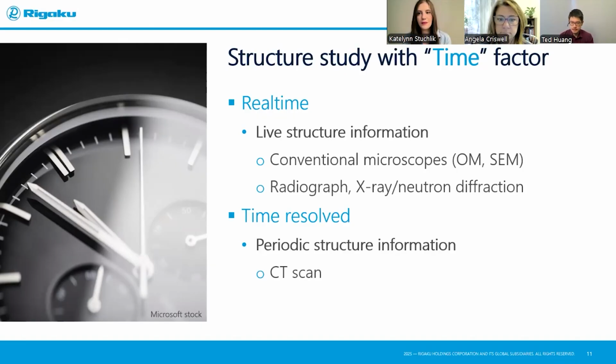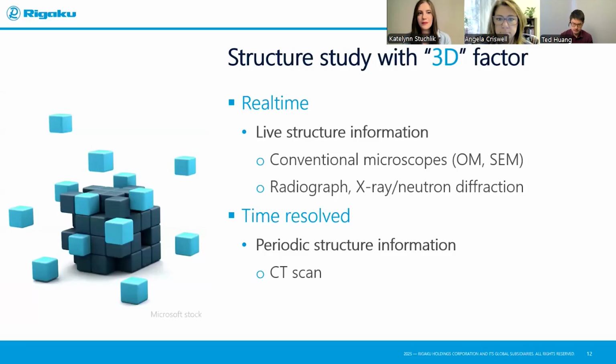Now, if you just look at this list, you might ask, hey, Ted, then doesn't that mean CT is not as good because you can only do time resolved? What if I want to do live, do real time? Wouldn't that mean other tools are better? Well, here comes another factor of the 4D study, the 3D factor.